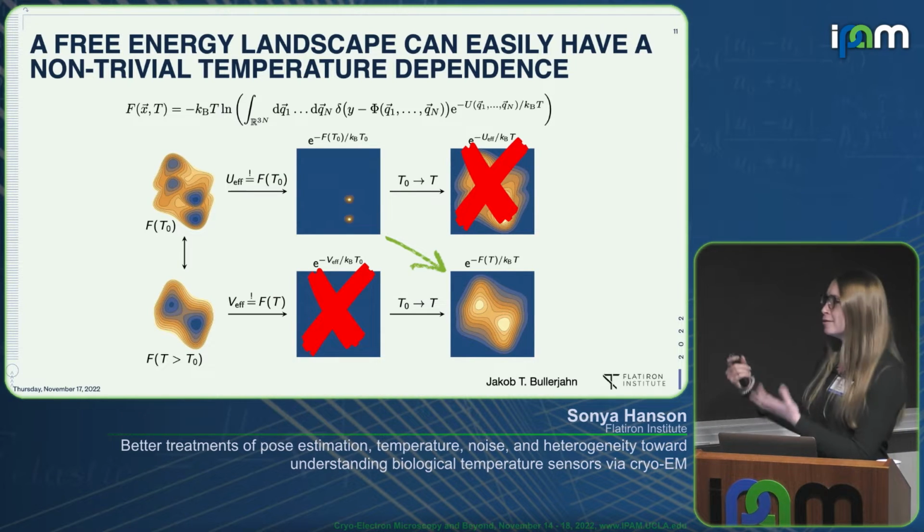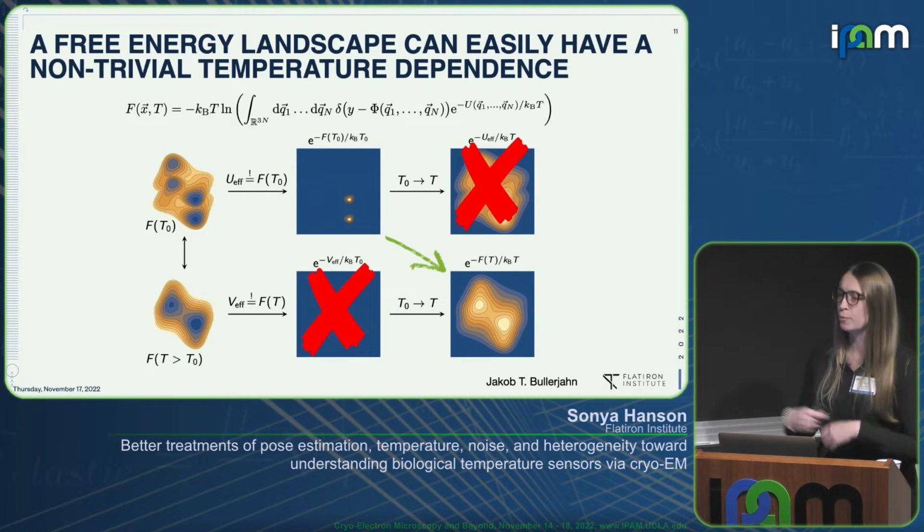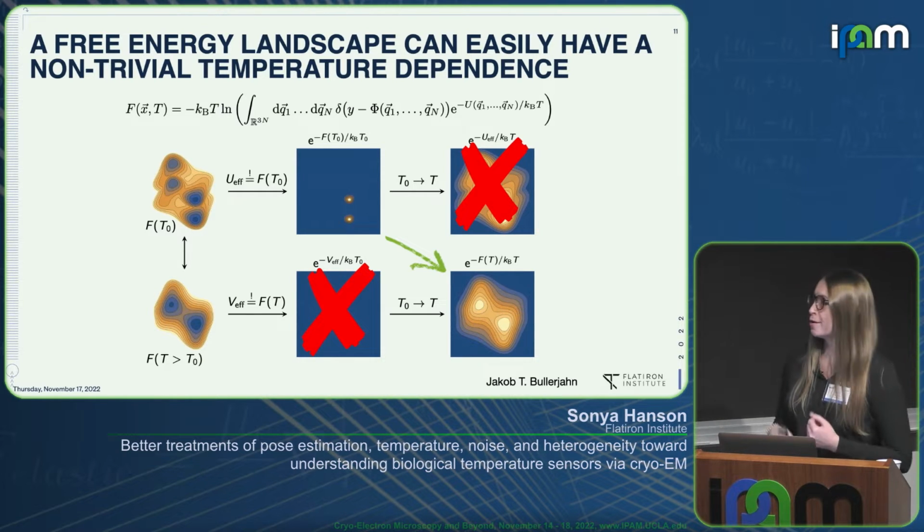I think this is just nice to point out, because we don't always think about it in this way. I think people have talked about temperature just as Brownian motion, and that's not always the case. There are many more complicated things that temperature can do to our systems.